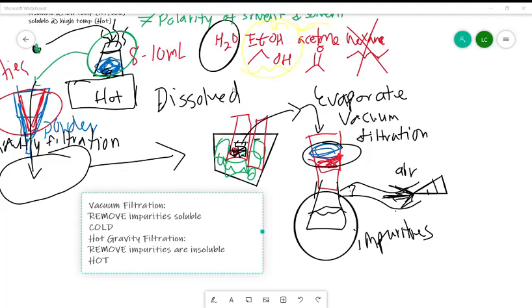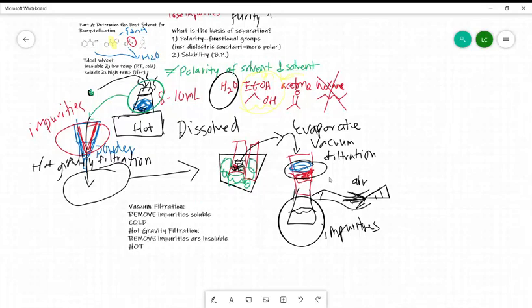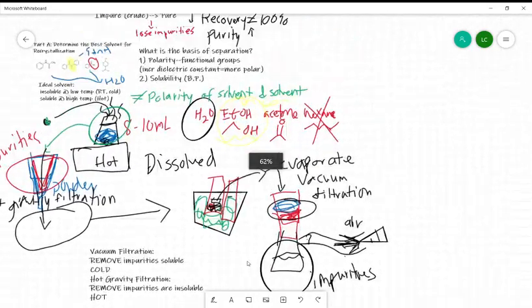Essentially, I'll explain that more in experiment 3. So for this one, you have salicylic acid, which is an aspirin. You have solubilities at cool temperatures, and you have solubilities at hot temperatures. This is a very common question that might be asked. So you want to definitely review how to do these calculations. So that would be very important to note. I know this is kind of messy.